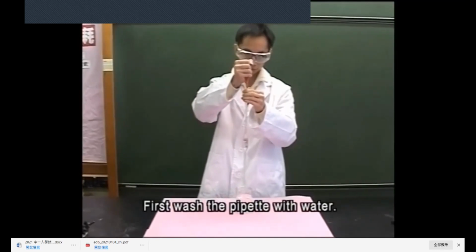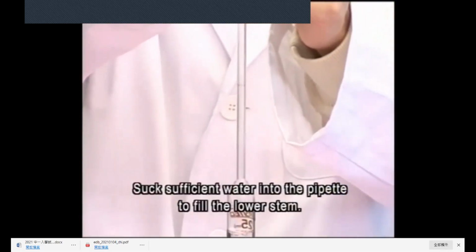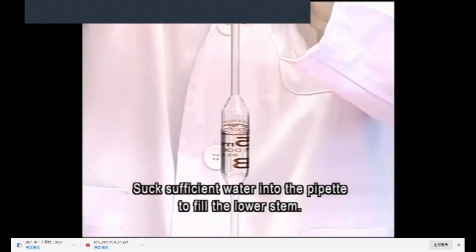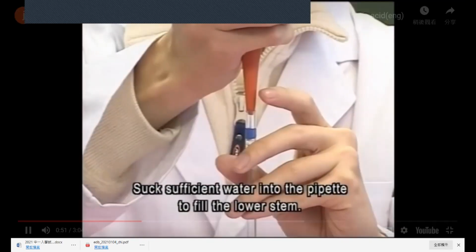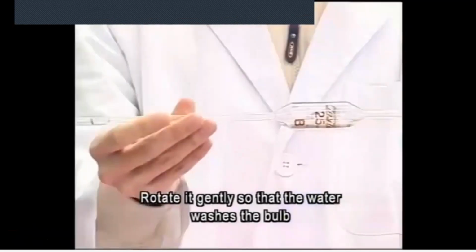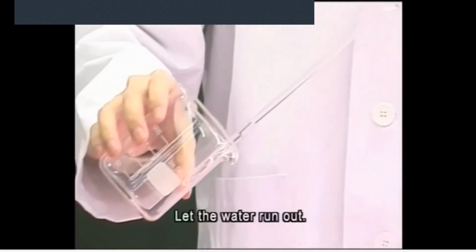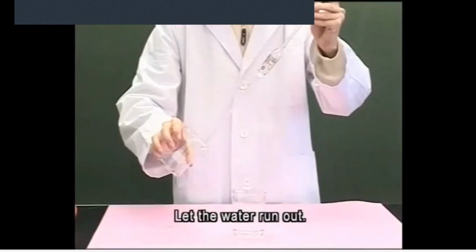First, wash the pipette with water. Suck sufficient water into the pipette to fill the lower stem. Hold the pipette horizontally. Rotate it gently so that the water washes the bulb and the upper stem up to the graduation mark. Let the water run out.